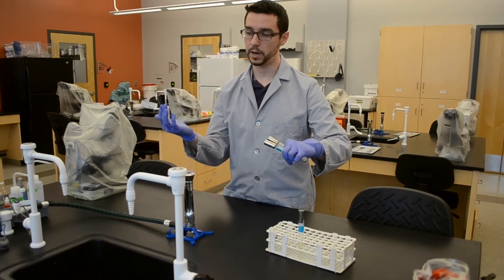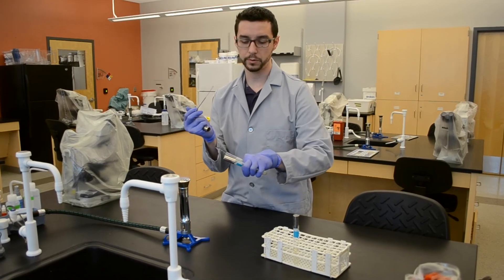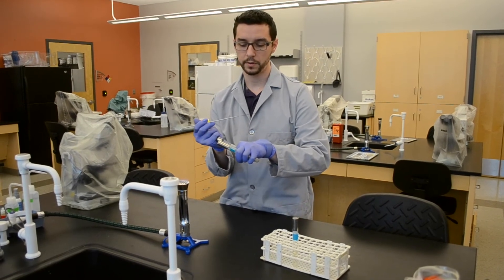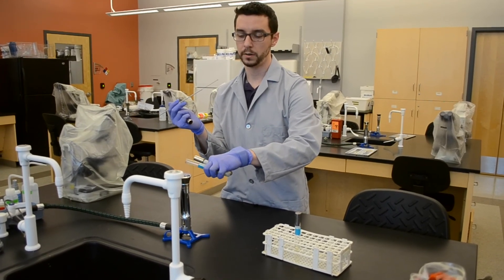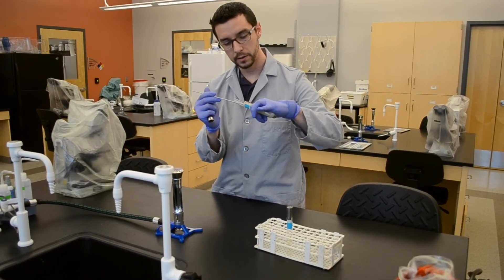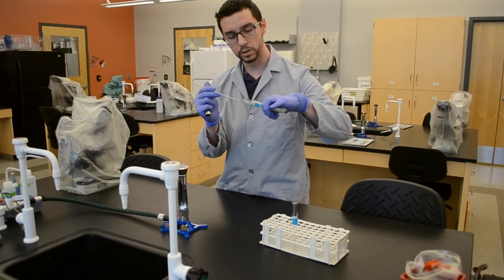With both tubes in hand and the loop sterilized, we do the same thing. Grab the cap with your pinky, decap, sterilize the tube mouth, reach into your source tube and get your bacteria on your inoculation loop, sterilize the tube mouth, cap, decap the destination tube, flame the mouth, and then while you are reaching in with your inoculation loop on that slant, find the horizontal and simply brush your inoculation loop across the surface very lightly.